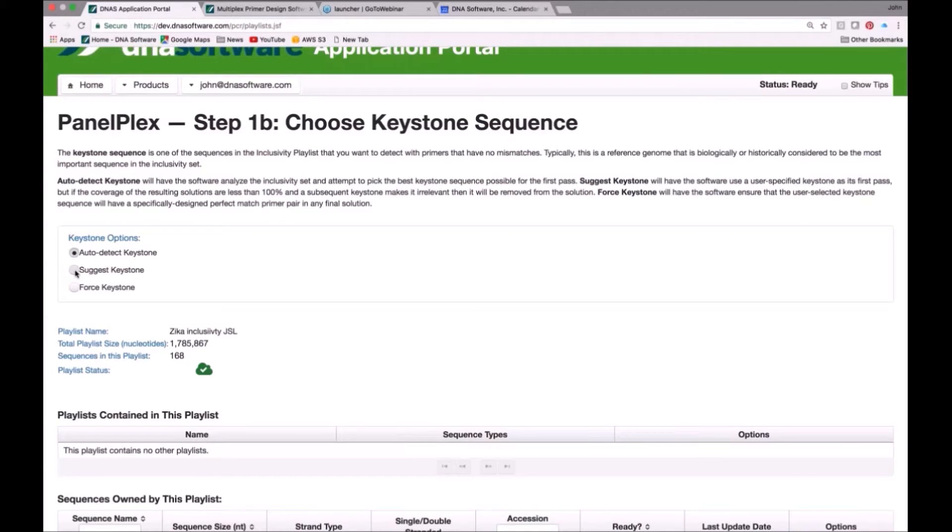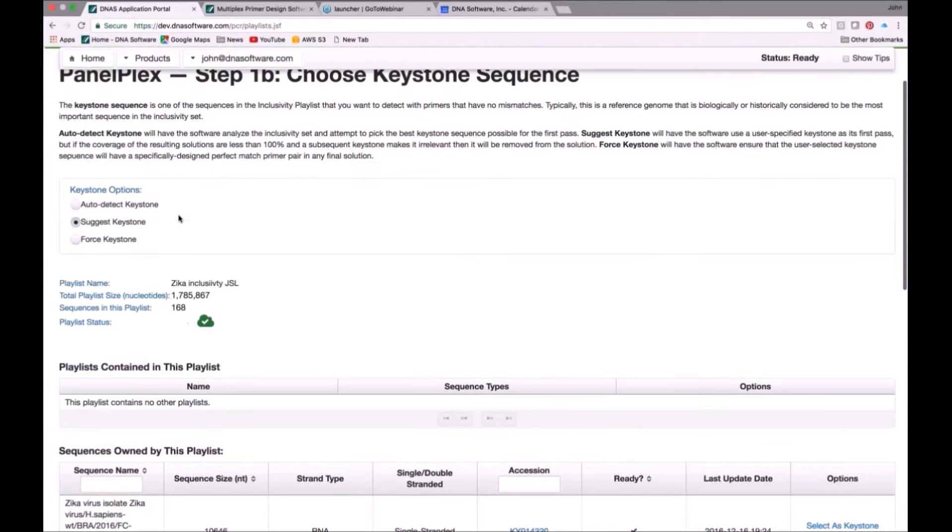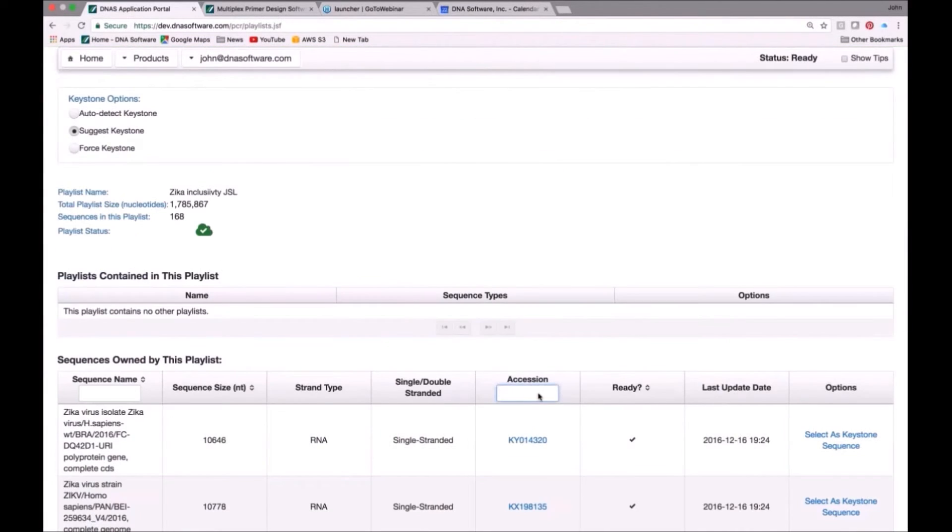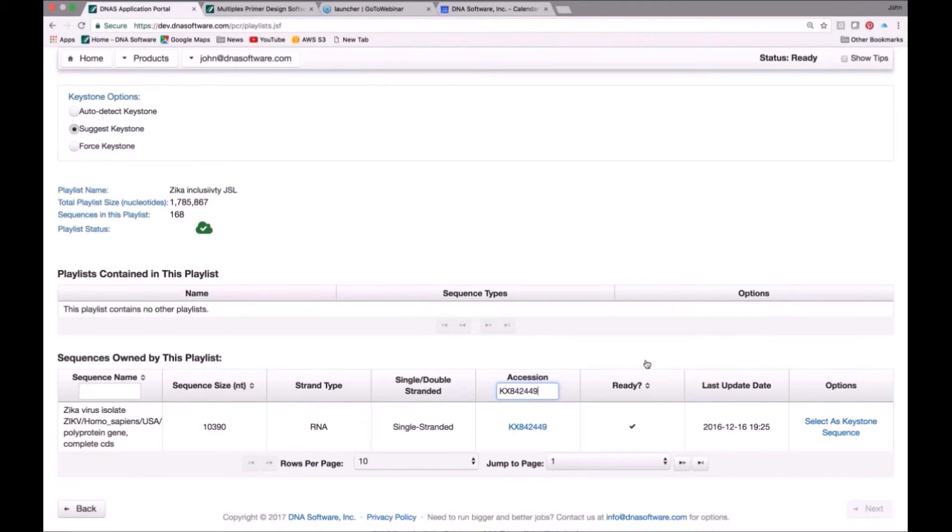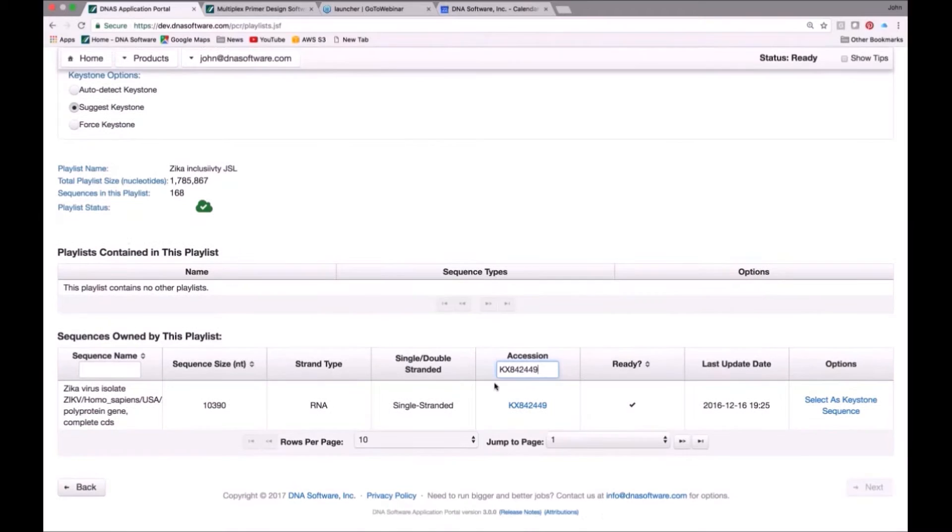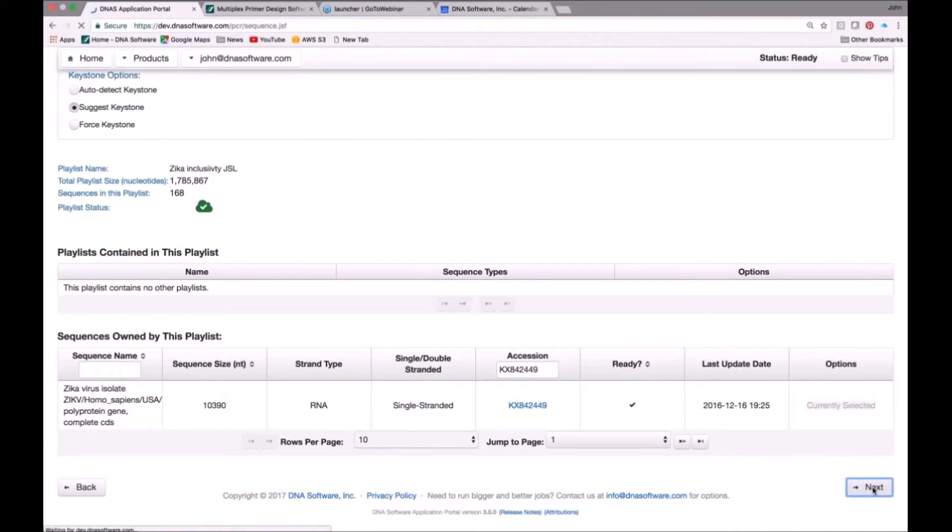But even if you choose a bad keystone, the software is smart. It will try other keystones as well and compare them to yours. So if you hit the select keystone, it will try several different keystones, including yours, to see which one works best. In this case, here I have a starting keystone. That was what I queued myself to remember. Before I plugged it in, this is just showing you the complete list of inclusivity sequences. Now I put this accession in and zeroed in on the one that I want to use, so that's what I'm going to use as my keystone.